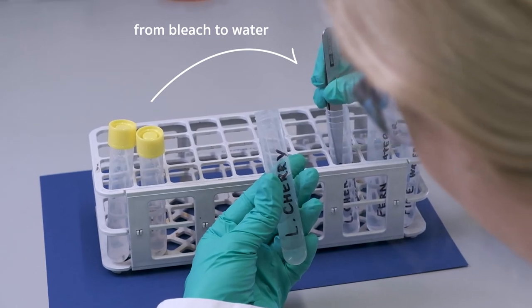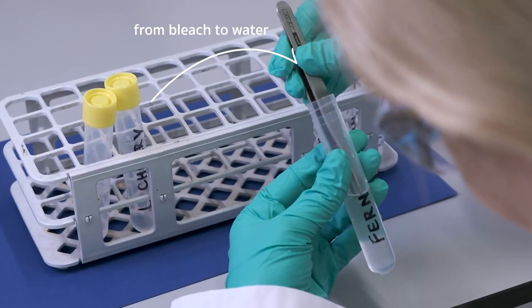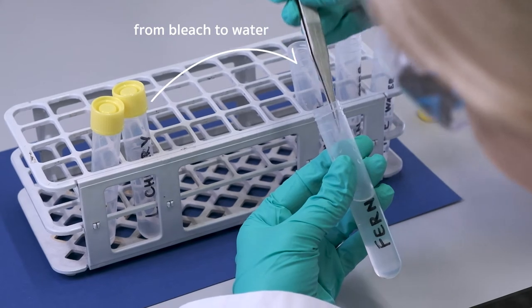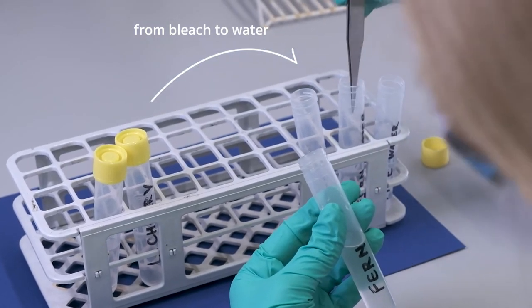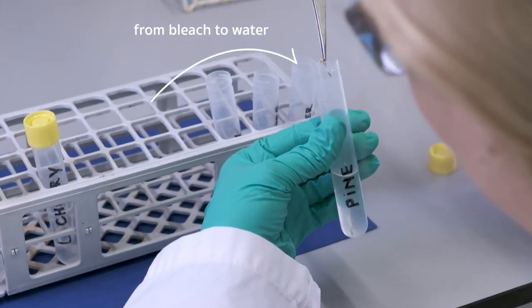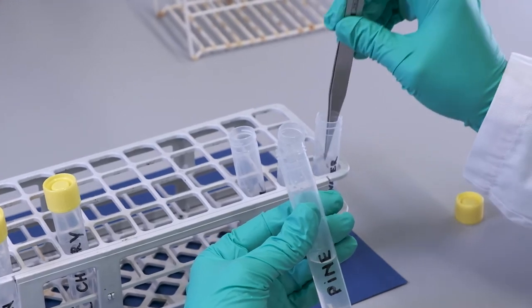Angiosperms, gymnosperms and ferns have very different shapes of their epidermal cells. You can also determine the species based on the shape of their epidermal cells.